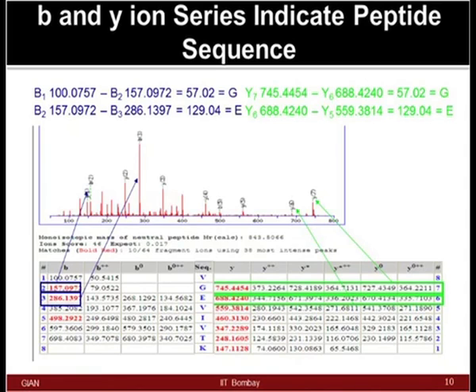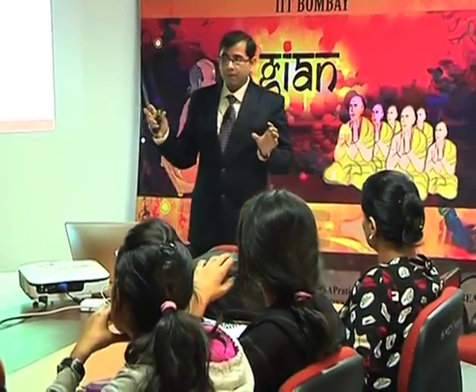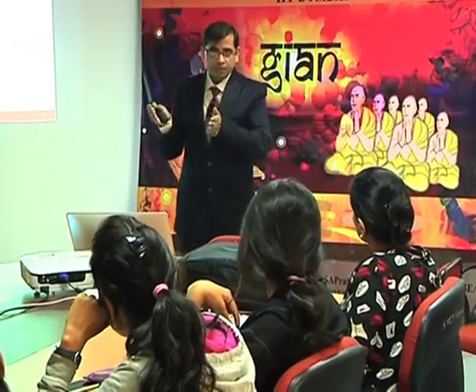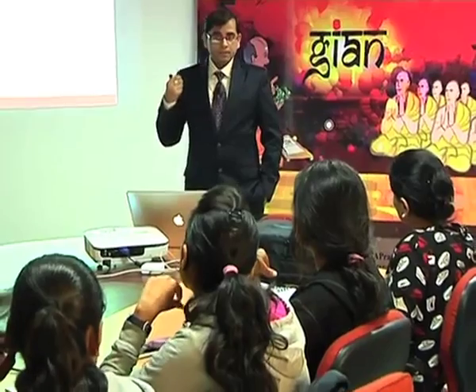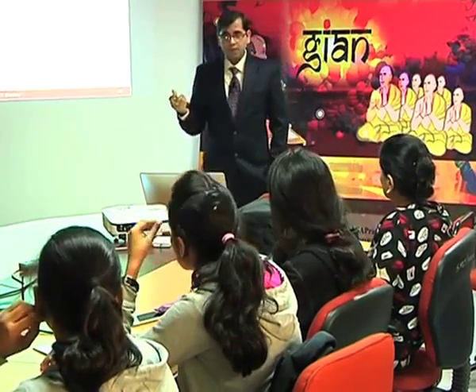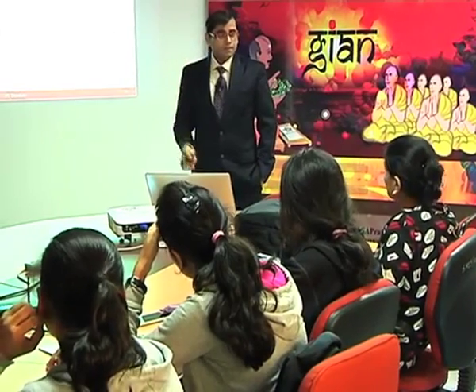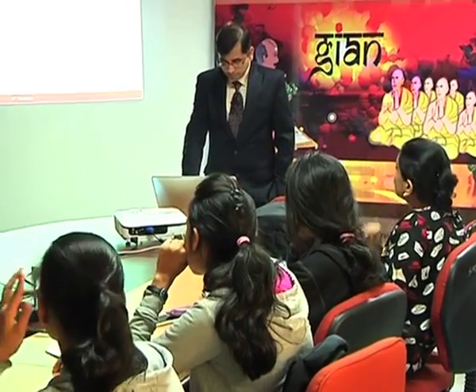So, despite that you may not be able to read all the exact differences in your table and sheet given to you, as long as you can cross check from both sides, C terminus and N terminus, that these differences are almost similar, then you can be confident about that amino acid being correct. So, this way one could actually manually derive these peptide sequences. Although from the software you can immediately get this information because these values are already fed there, by now I think you can do this yourself.